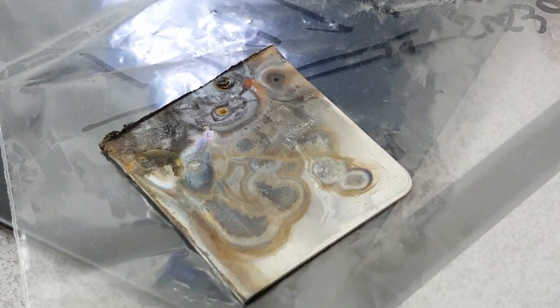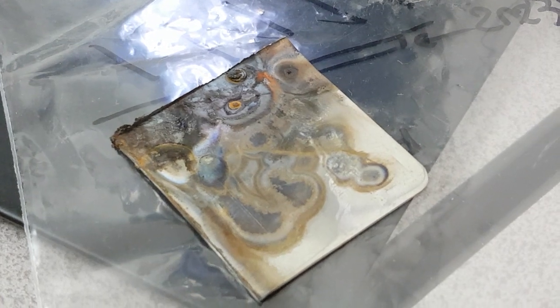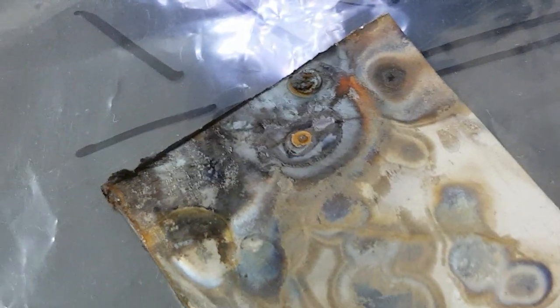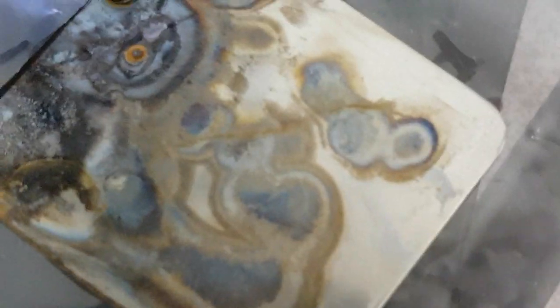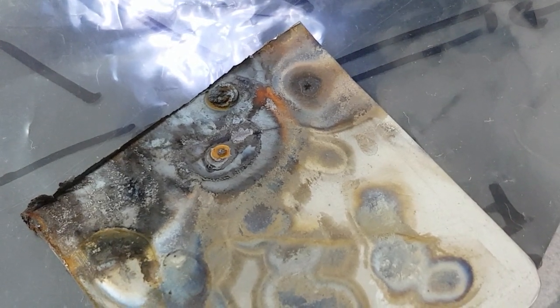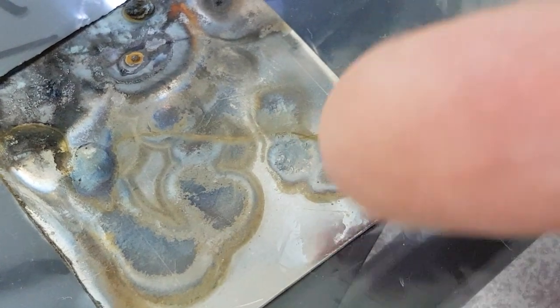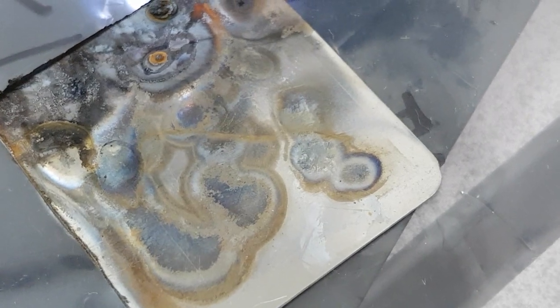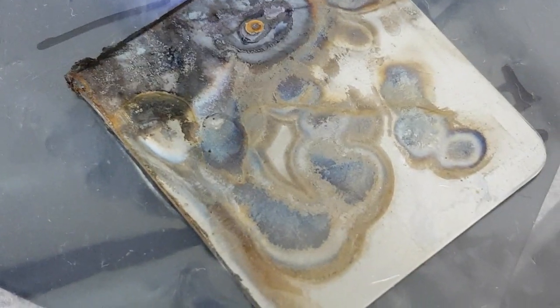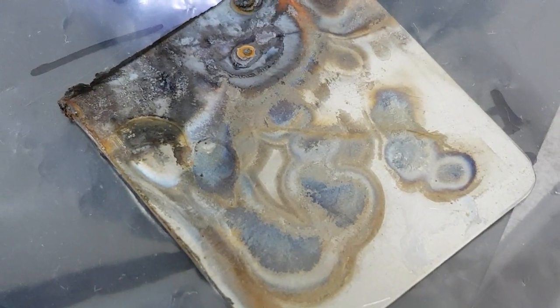Here is the other side — presumably the side that was touching the water, although it may not have been. It would have been helpful if the samples had been marked. When you look at it with your eyes and with this camera, it just looks like some oxidization. There's a spot with a yellow ring around it, which might be interesting if we saw a lot of sulfur there, because that would be two oxygens fusing. This is going to be very interesting when we look at it under the SEM. It's got a feature at one end and then this kind of teardrop shape out to the side.